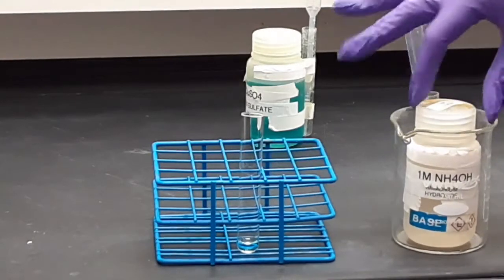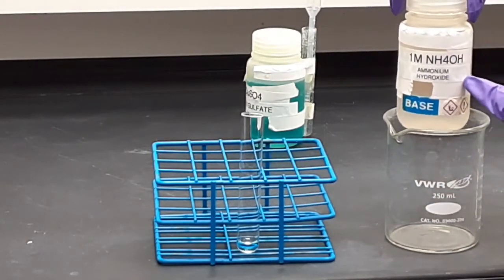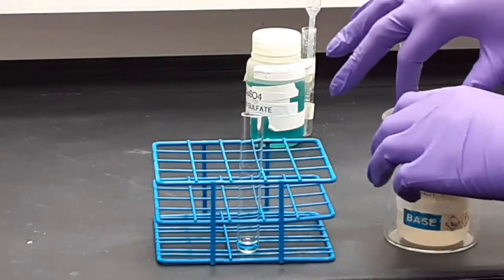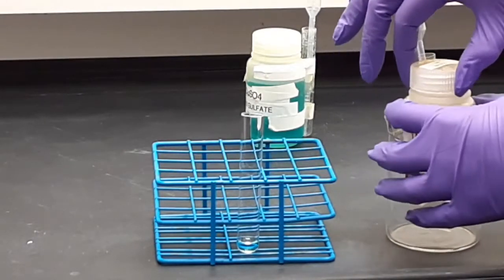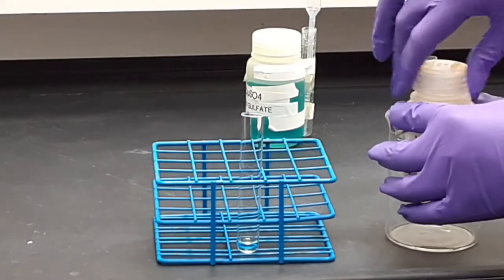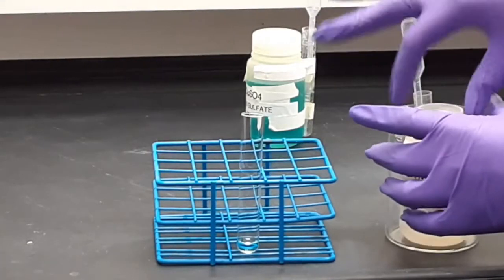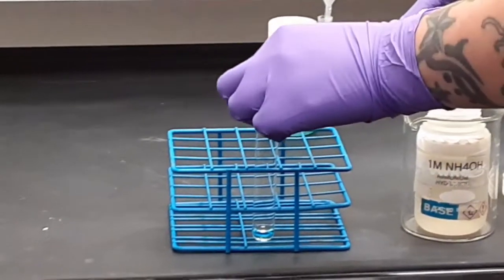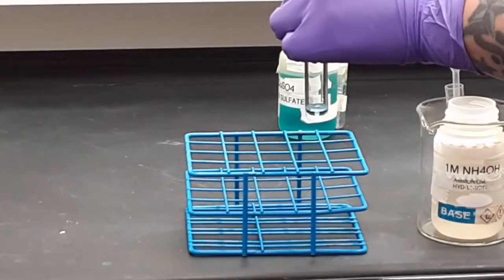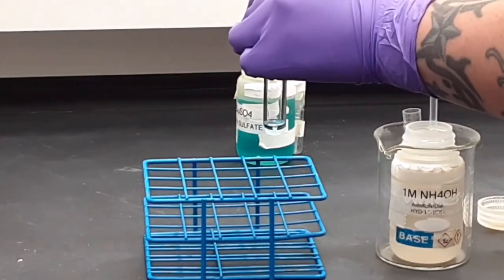Now she's going to add ammonium hydroxide. Now this solution was just made. Its concentration is as correct as we can make it. However, this material is inherently difficult to get an accurate concentration on, just like sodium hydroxide, because of side reactions that occur with water. So the results may be a bit of a surprise. Here comes our drops.